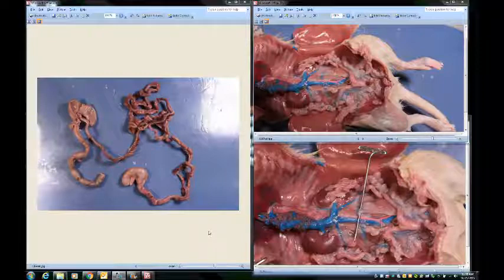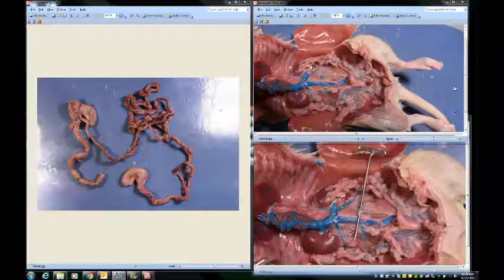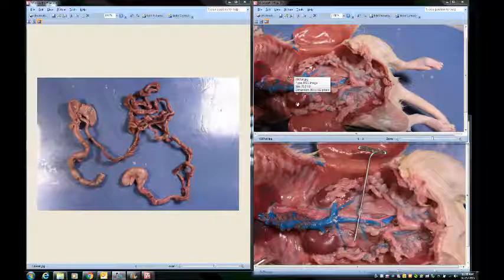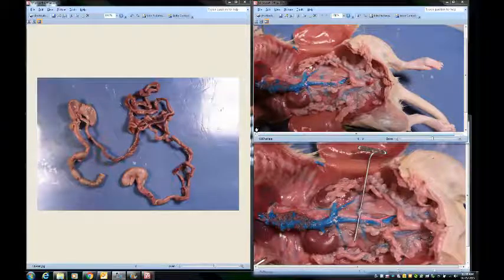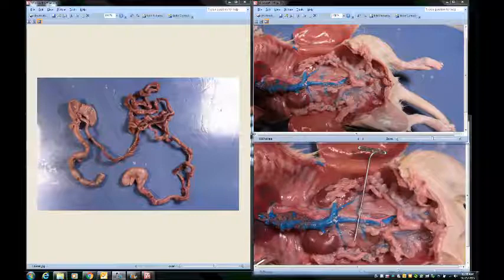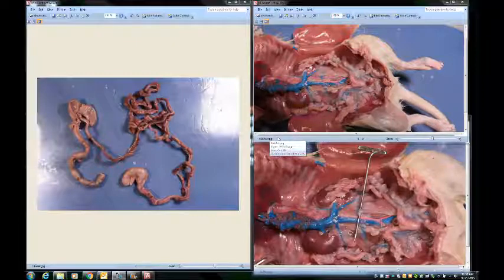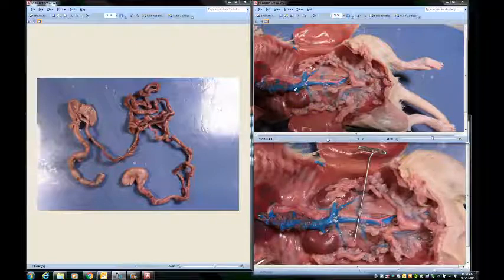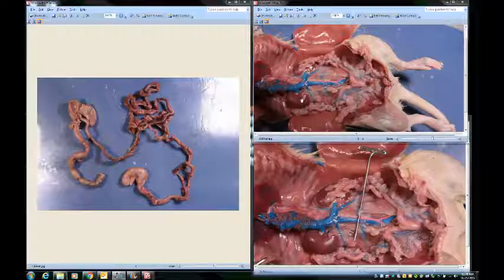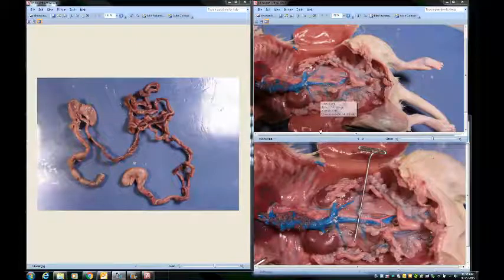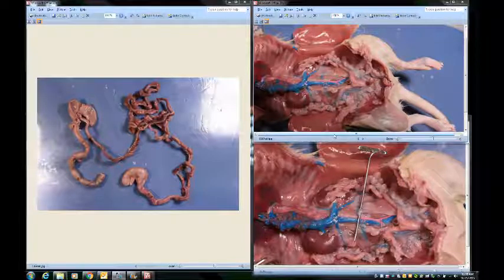Once you remove all the intestines, it's much easier to see the excretory system. If you look at the picture in the top right corner, you can now see the kidneys. The rat has two kidneys — they look just like kidney beans and are easy to find once you remove the intestines. Here's kidney one and here's kidney two. In these rats, the veins have been dyed bright blue so you can better see them coming out of the kidneys. These branches are called the renal veins.